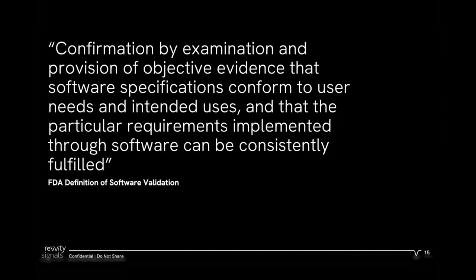So the FDA define what software validation is, and part of the story here is it's not just about the validation itself, but the validation is really a way that you can test to show that the software is reliably working as it's designed. But part of validation is also verifying that the features delivered through the software actually solve business problems that your users have. So it's part process in doing the testing and part that the functionality actually needs to do what you need it to do your job.